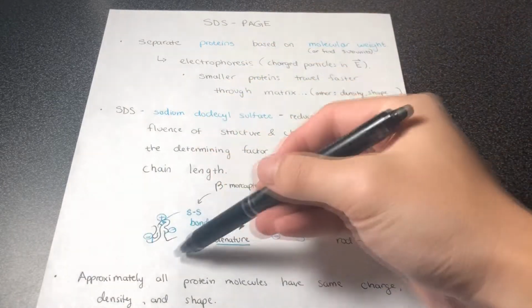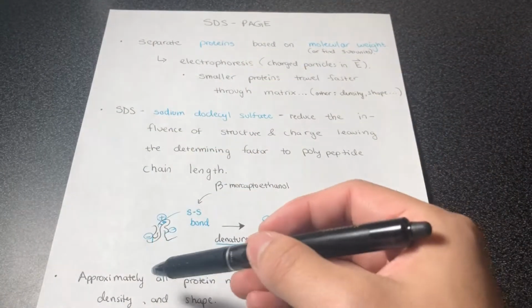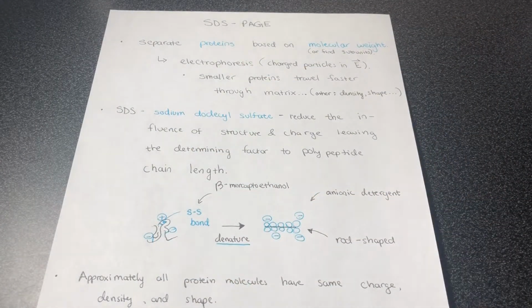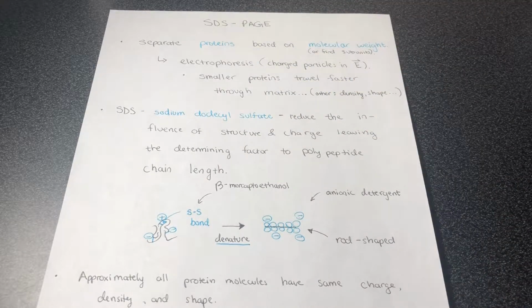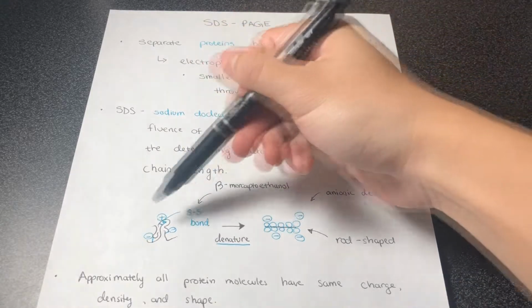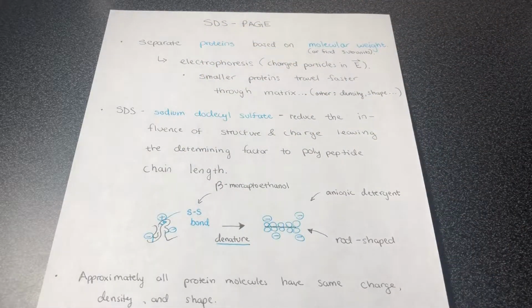If you have this protein, this poorly drawn protein, has positive and negative charge all over, and in between the groups are disulfide bonds. We use 2 ingredients. We use beta-mercaptoethanol, and we break these disulfide bonds. We add SDS, and it denatures the protein, getting rid of the shape.